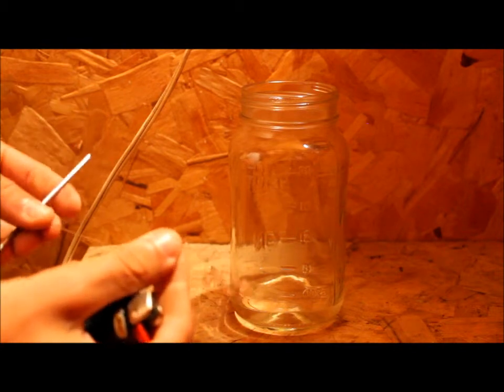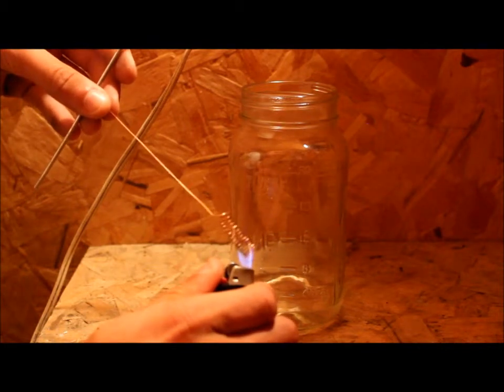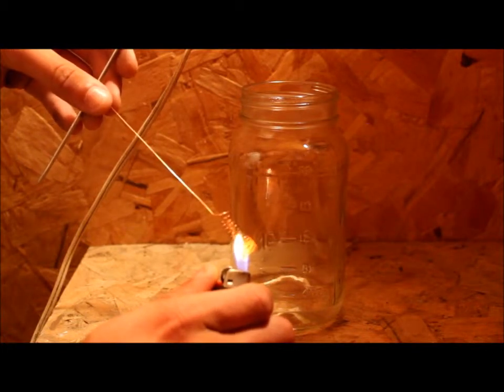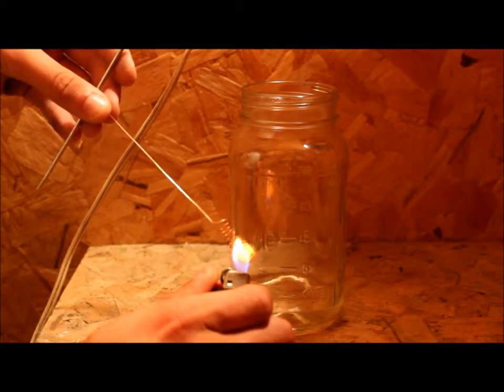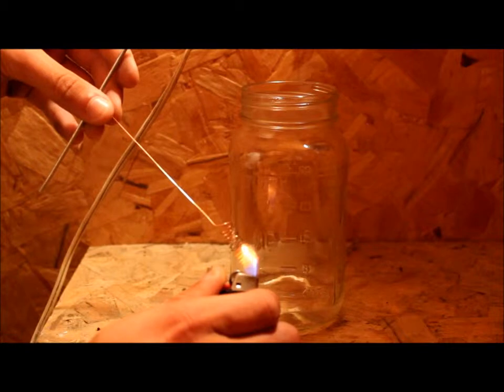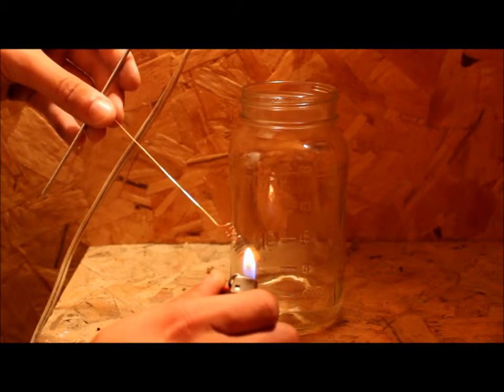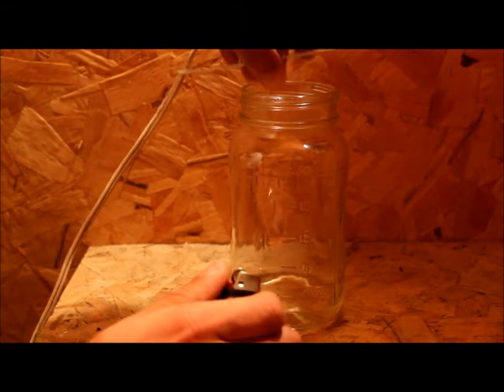Now we're going to heat the copper filament up with a lighter. I want this to glow red hot. We're going to place this very carefully into the acetone.